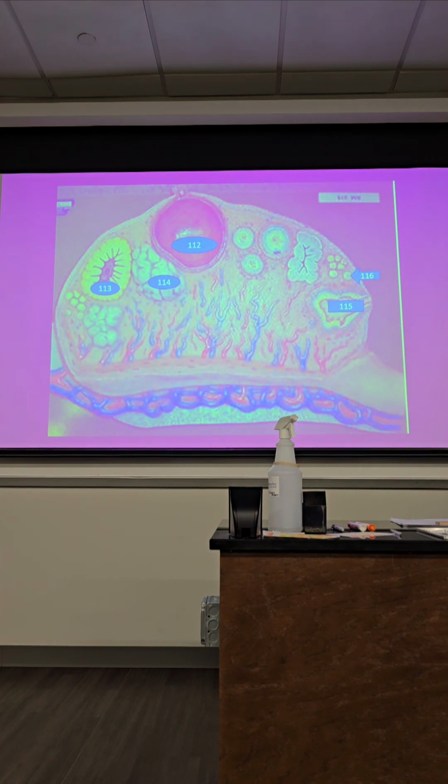Okay, so this is a picture of what we're looking at here. It looks like an ovary. Your picture is not the best, Professor. Does that look like the breast? Is that the testis? That's my breast, baby. It's an ovary. Does a breast look like this? I don't know. It looks sick. I'm totally lost.